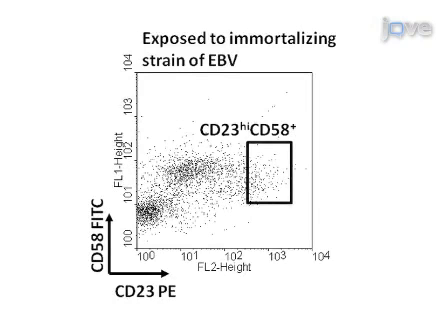A successful outcome is predicted by the presence of CD23 high, CD58 positive cells. As seen in this scatter plot, approximately 2 to 3% of live cells on day 3 to 4 after exposure to Epstein-Barr virus have this profile.